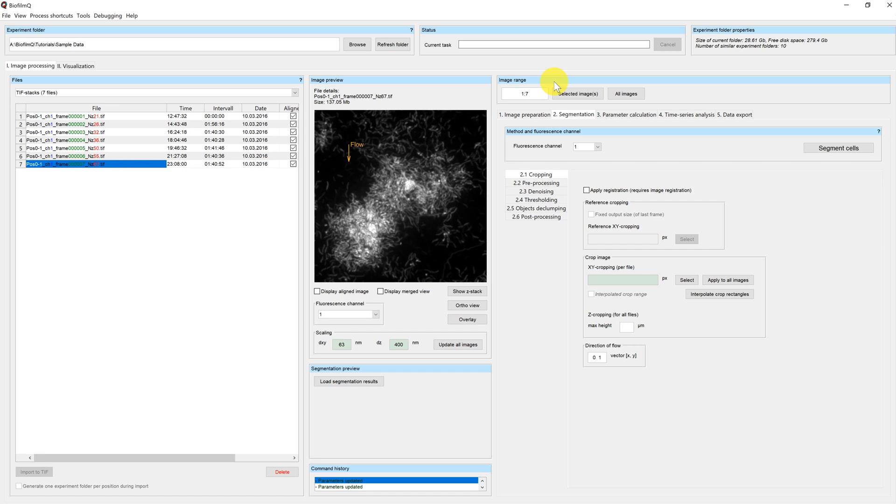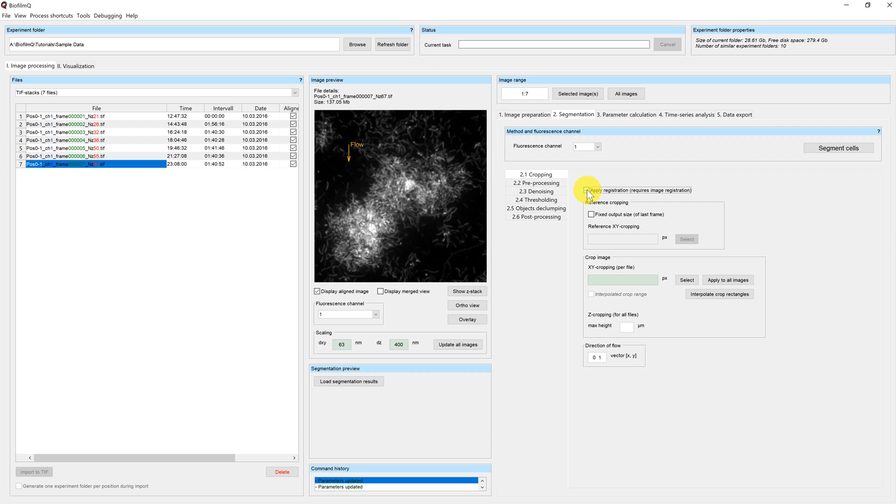If you have a long time series and there's a lot of movement between the individual images, I would recommend to correct this before you apply the cropping by using the image registration. How you can register your images is explained in a separate video. So if you have registered your images before, you can now click on apply registration.